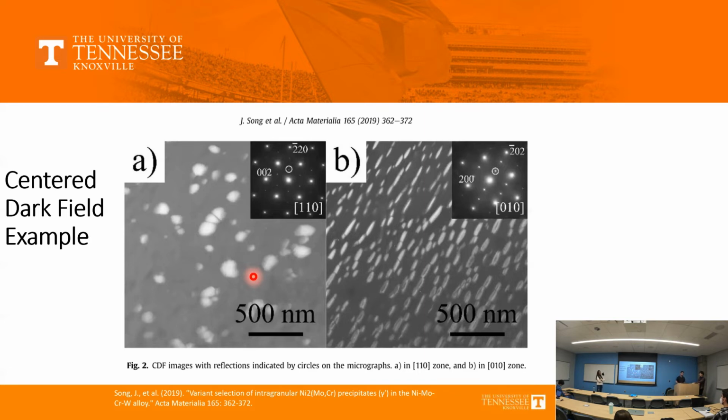In this alloy system, for example, there are 6 directional variants of these precipitates with respect to the matrix. To image them all, they had to walk through, I think, 3 different combinations of zone axes to capture them in every orientation they're looking for. Do you have anything, Shradha, or should I press on?